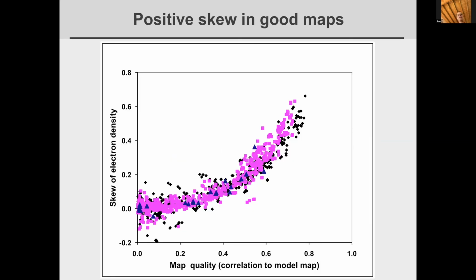If it's a good map, it's totally obvious if it's good. And that's good to keep in mind, so that if it's really good, you know it. If it's really bad, it could be okay. It's certainly not really good, but you can't be sure if it's good or bad. Next slide.